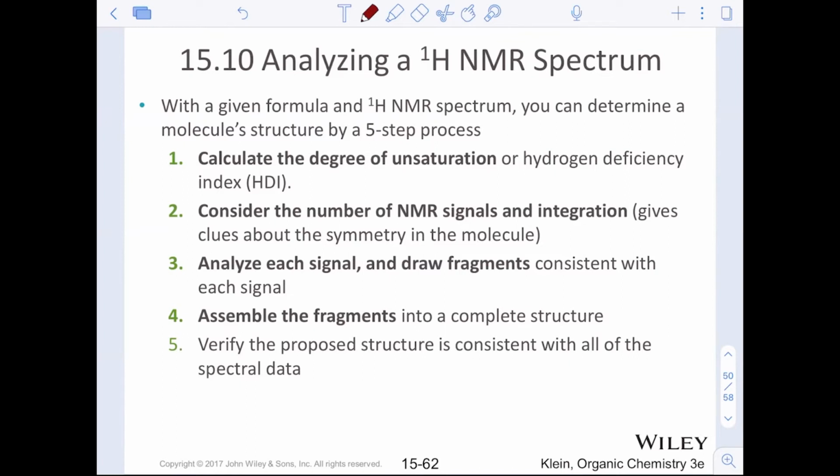We're talking about if I see a carboxylic acid, if I see aromatic protons, start writing down different pieces of the puzzle. Then we can start completing the structure by putting these pieces of the puzzle together based off of the neighboring multiplicity that we see. So it's really degrees of unsaturation followed by the number of signals and the integration and the chemical shift. Last thing that we want to do is identify multiplicity so that we can piece it all together. All right, we'll practice a lot more in class. I think the best way for this to be really understood is by practicing.